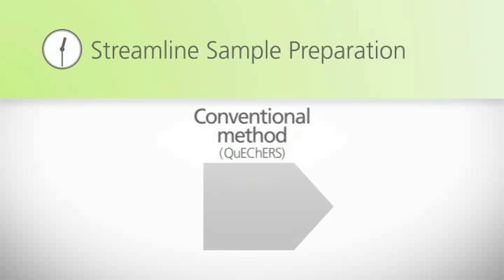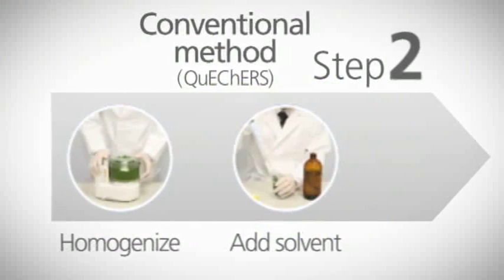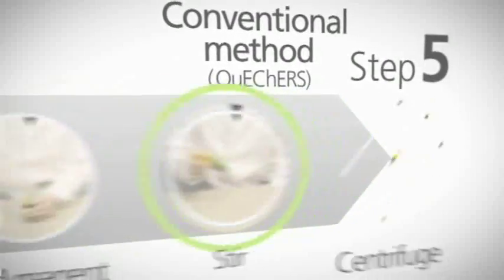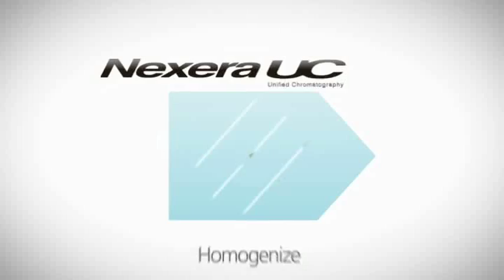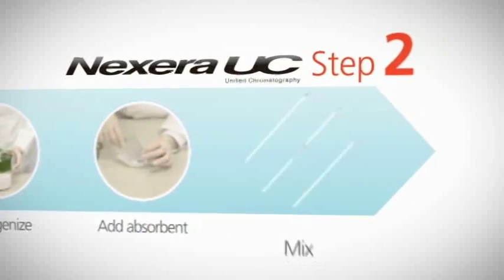Conventional methods for analysis of residual agricultural pesticides require 15 sample preparation steps. Repeated addition of reagents, mixing, and centrifugation are needed prior to analysis. Nexera UC eliminates many of these cumbersome steps, allowing sample preparation to be completed in just four steps.